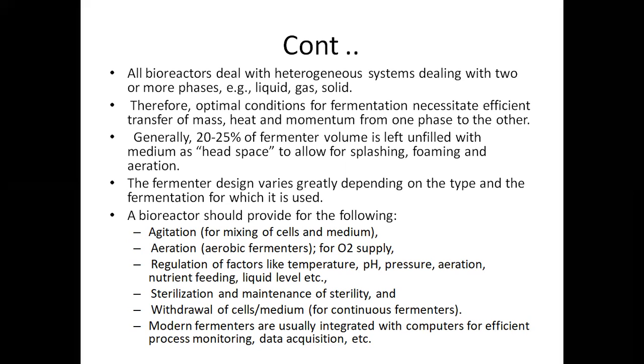Generally, 20 to 25% of the volume is left unfilled at the top of the fermenter. That empty space is known as the head space. And what is the function of that head space? Why are we leaving that empty space? Head space is to allow for splashing, foaming and aeration.